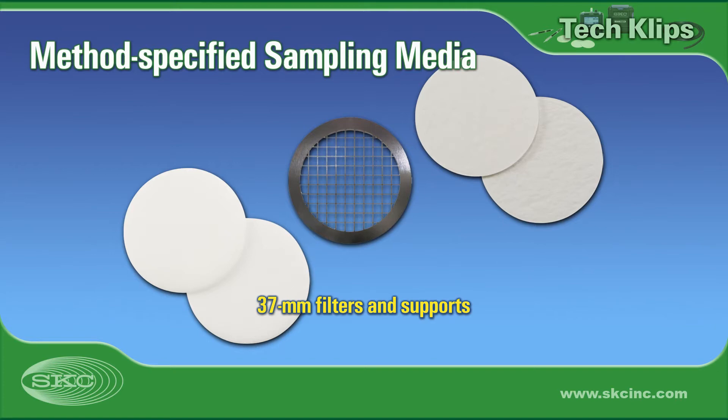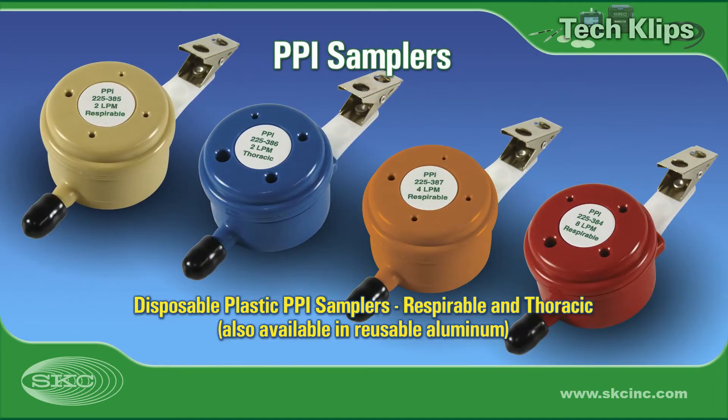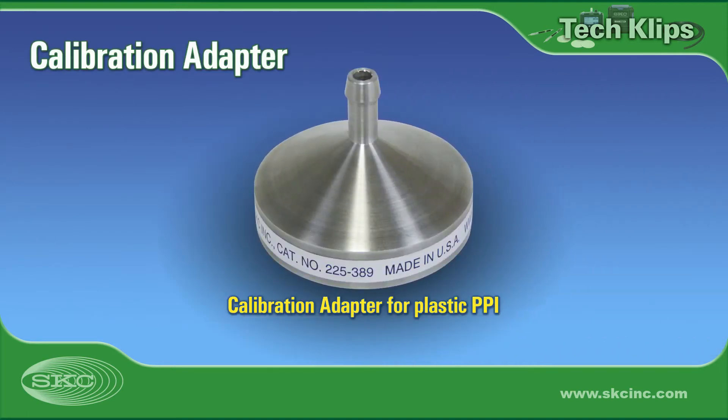Contact your laboratory to condition and pre- and post-weigh filters if sampling for gravimetric analysis. PPI samplers are available in reusable aluminum or disposable plastic for respirable or thoracic sampling. Disposable PPI can be purchased pre-loaded with PVC or MCE filters if only chemical analysis is desired. A calibration adapter is available for disposable plastic PPI samplers.